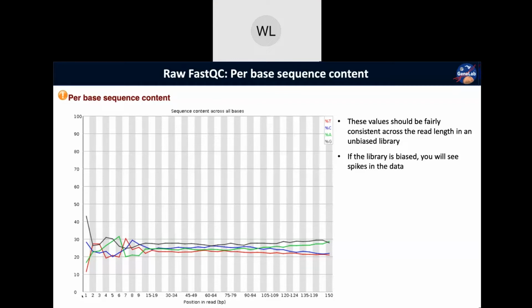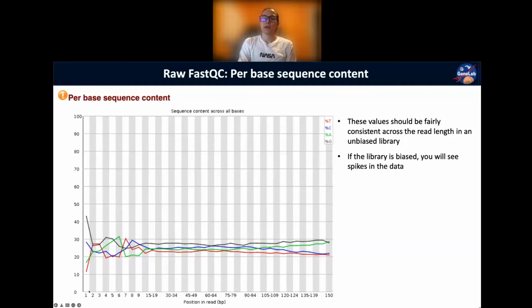I thought the numbers were going to even out gradually, because you're talking about the total percentage of the sequence. So here's the total percent. This is the percentage of A, T, C's, and G's at position 1 of all the reads. If we have a very diverse library, position 1 of all the reads should be randomly distributed, which means it should be roughly even A, T, C's, and G's, unless there was some bias in our assay to cause that first base pair. Here, we got 45% of the reads where the first base pair is actually a G.